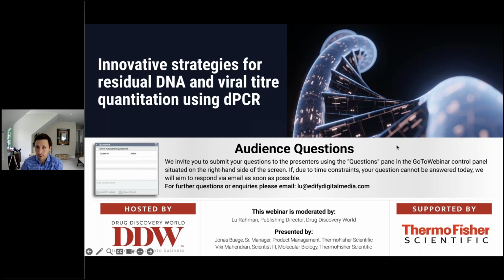You need to quantitate your control in the same way, right? If you use different approaches to quantitate your control and then use it both for your relative determination on qPCR and for digital PCR, you may end up with different results. So I always recommend, when you're using a control, quantitate the control on the digital PCR side.